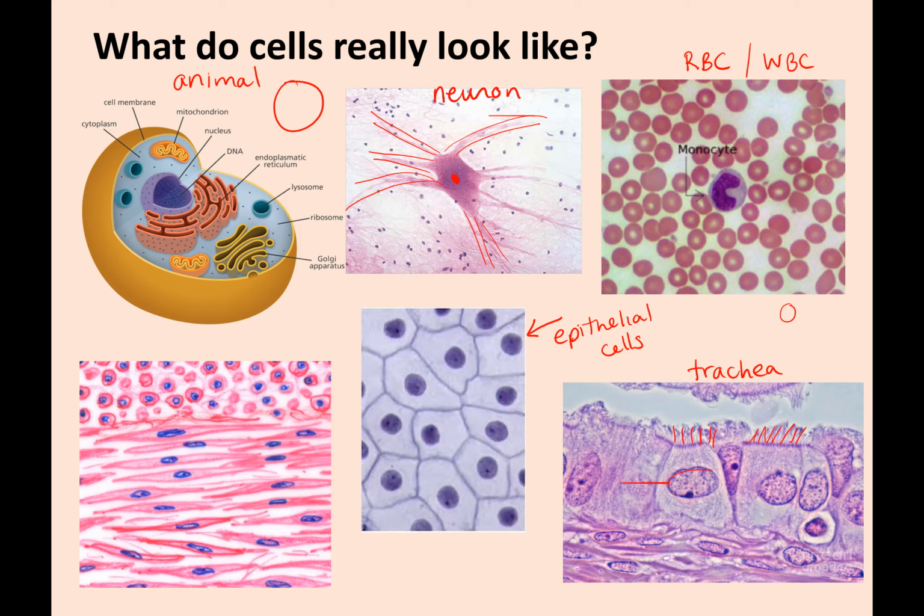You can see this big nucleus, and this is the outline of that specific cell. And then below it you can see other cells. This here is muscle. Long fibers, and the purple stained is the nucleus. So animal cells come in all shapes, different sizes, and again with the light microscope, really the only detail you can see is the nucleus, and you may see a dark spot representing the nucleolus.